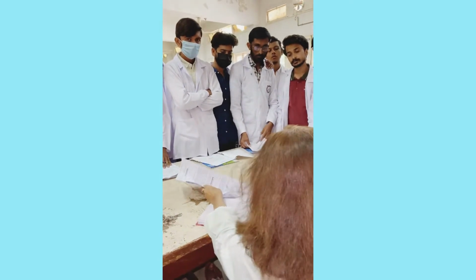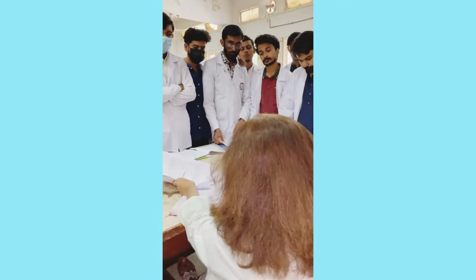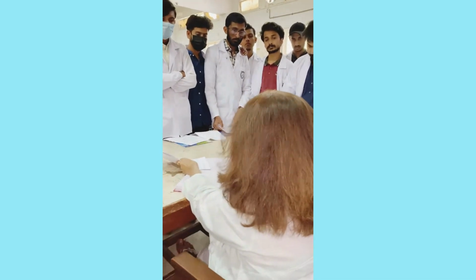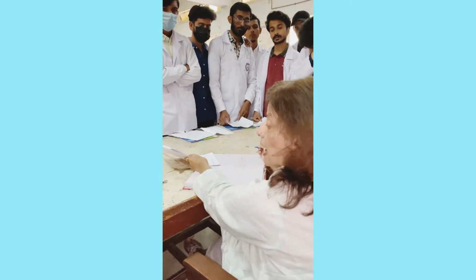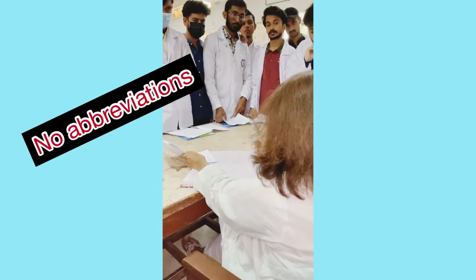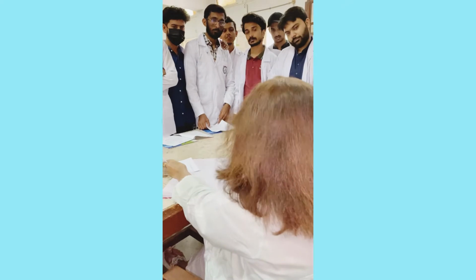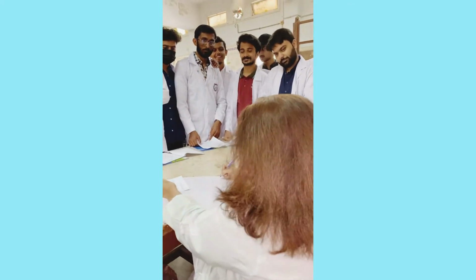our synthesized organic compound. I am using abbreviations. You are not going to use any abbreviation. Keep that thing in your mind. Write down in the full form. Okay? You are not qualified yet to write down things in the abbreviated forms.